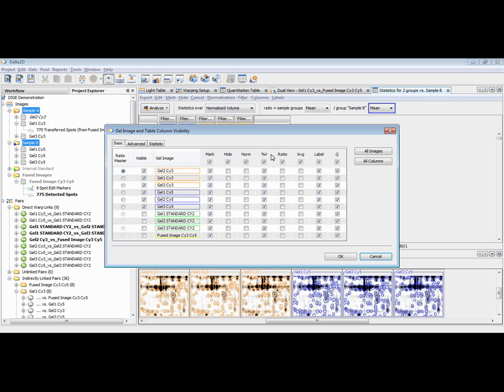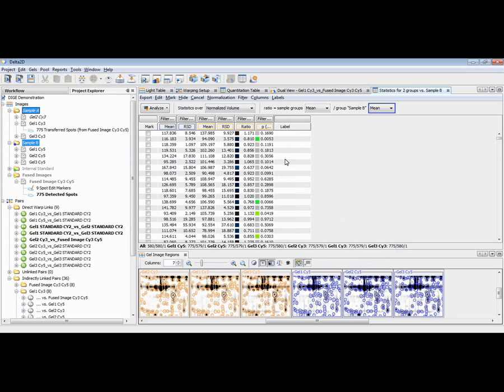Sorry, I didn't properly click here. Like this, no, okay. Now we get the ratio back. All the ratios and p-value columns are then calculated by comparing the respective group with this new reference group. And this is the one that I have selected first before opening this table.